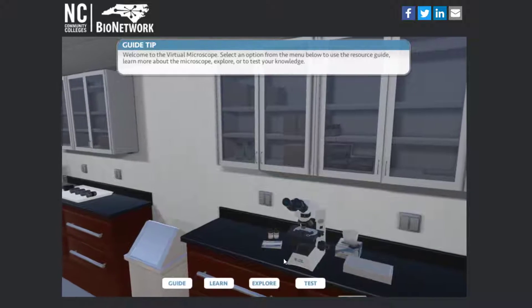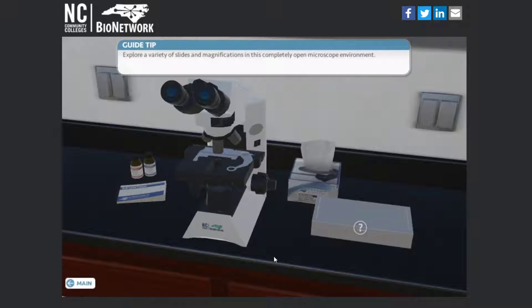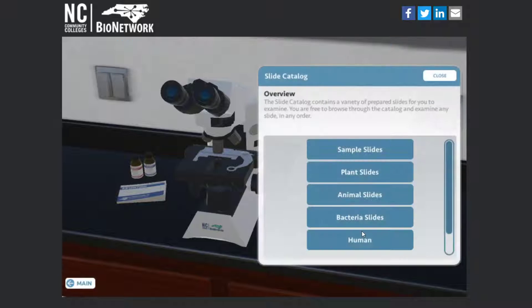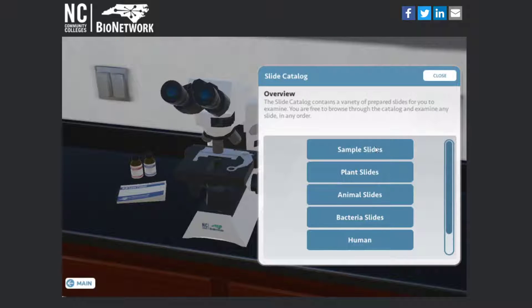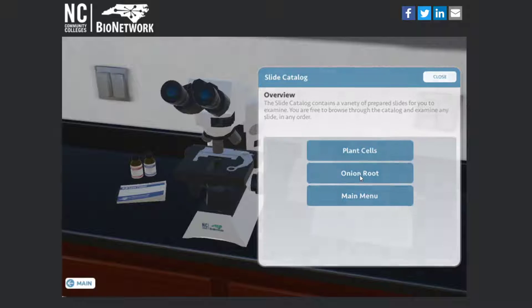So for now let's just explore. Let's take a look at a few slides. You can open the slide box and pick some out. So let's look at some plant slides. We'll start with some onion root.